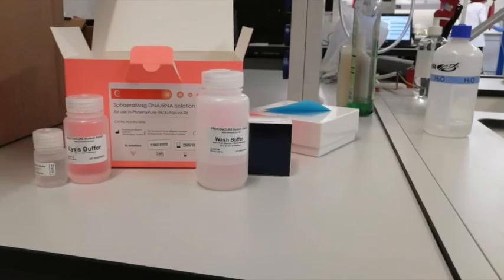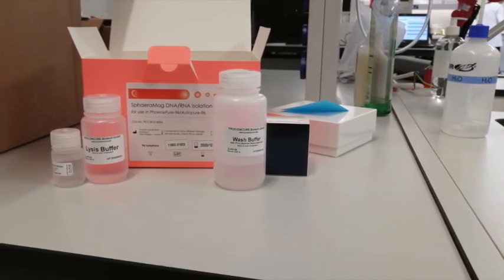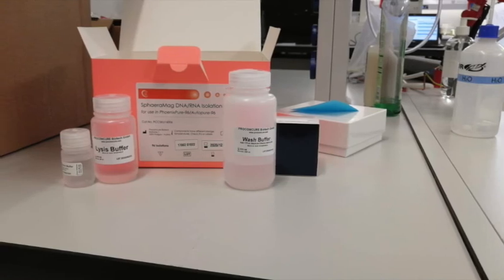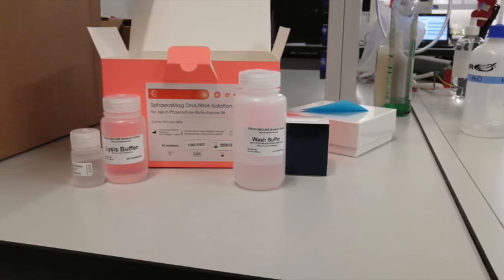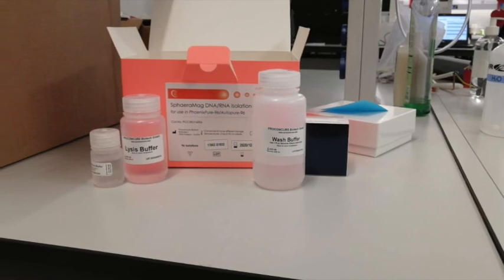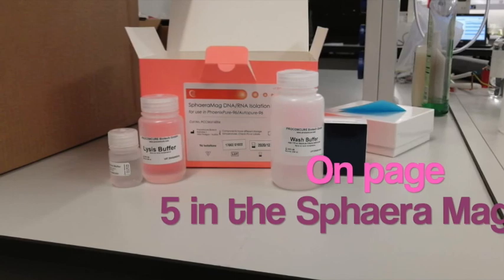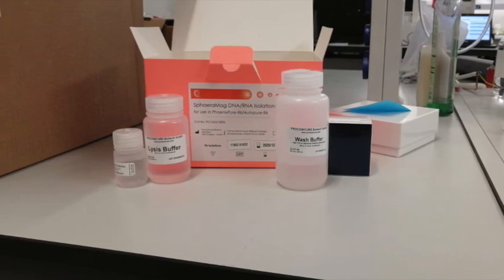Please also note there are two types of Spheromag boxes — they are the same product. The only difference is that there is a pre-filled version and a non-pre-filled version. The pink one is the non-pre-filled; you must follow the instructions for use on how to fill it. We have used the pre-filled version, which comes in blue, for this session.